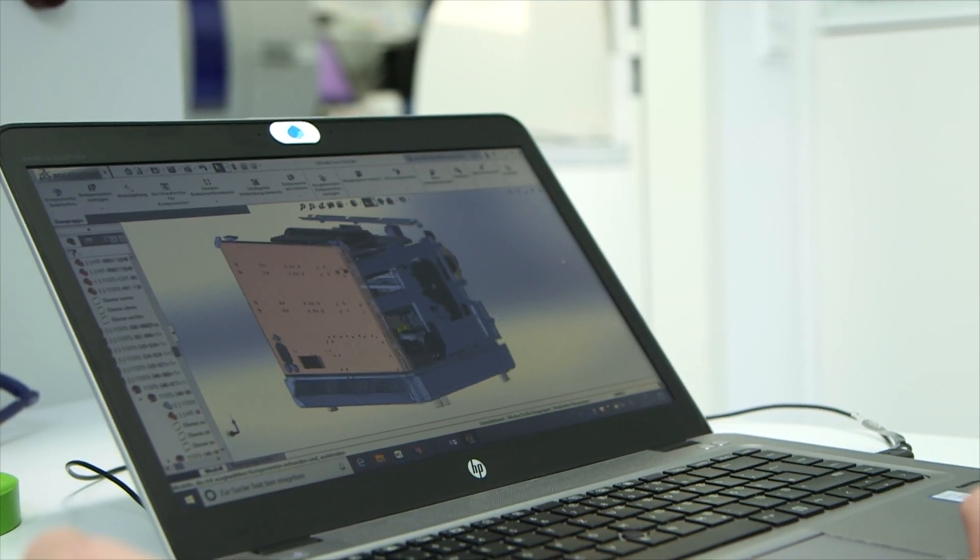The QIAcuity is the first fully integrated digital PCR system and it will change your perception of digital PCR.